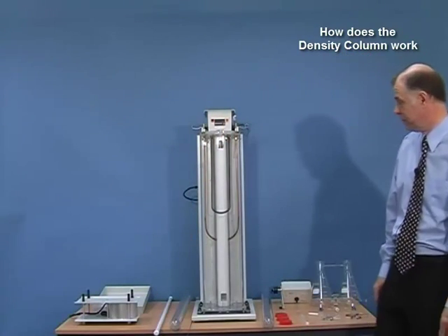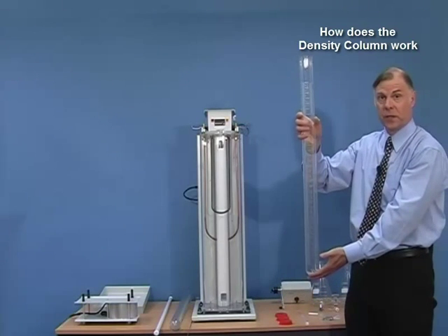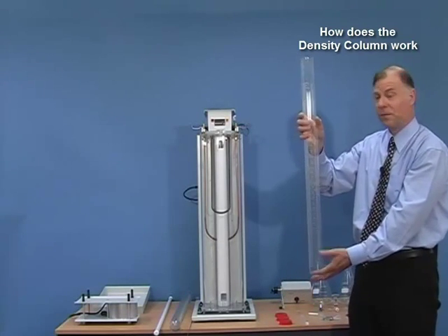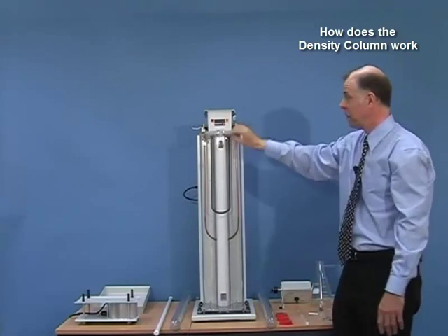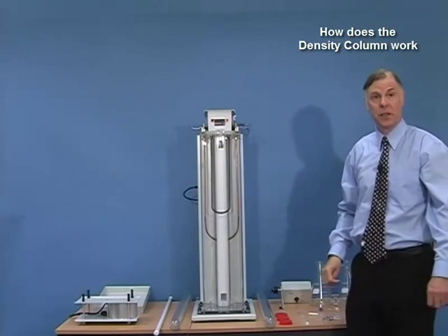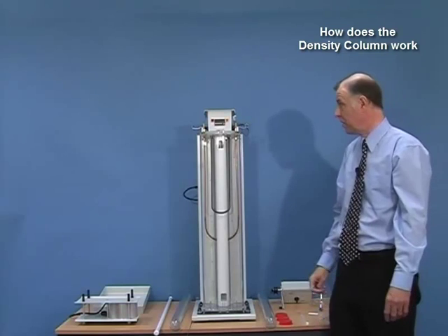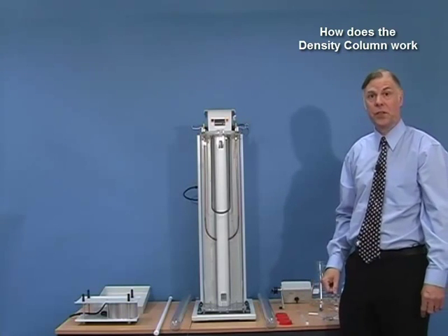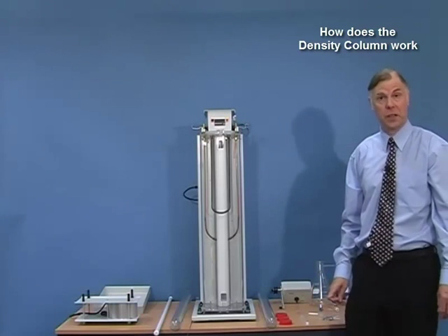The complete Davenport density column system contains two graduated tubes or density columns, and these fit into the main assembly which contains a water jacket. This water jacket is maintained at a constant 23 degrees centigrade as stipulated by the standard. The reason we have to maintain that temperature is because the density of the liquid will change with temperature.